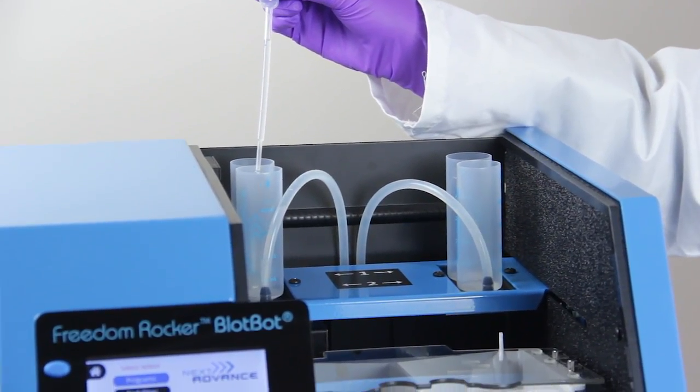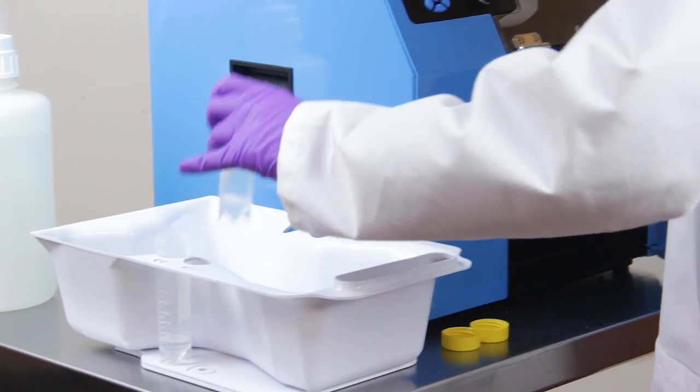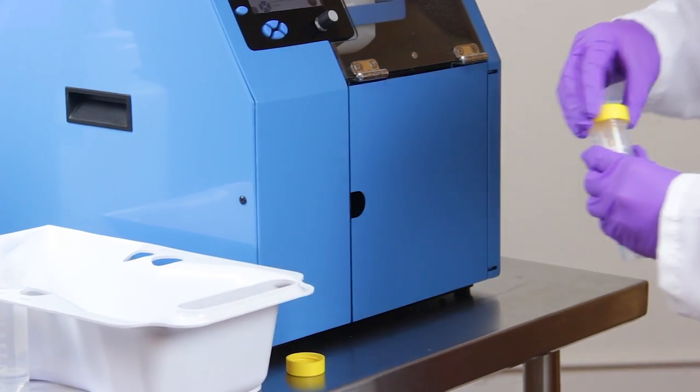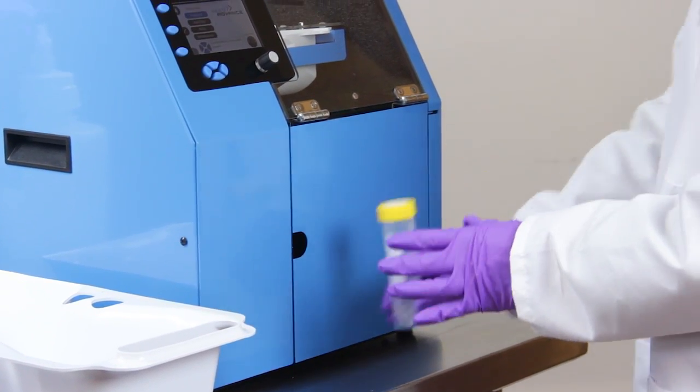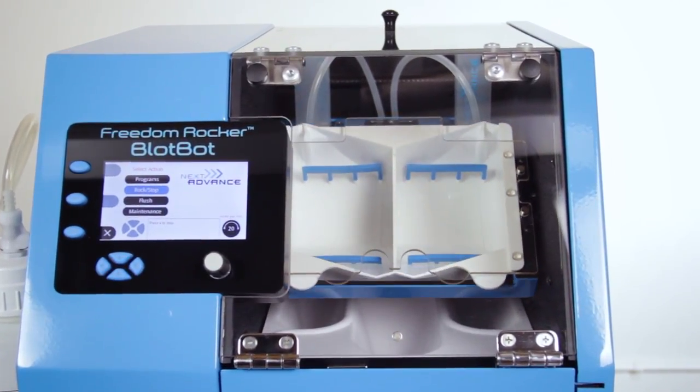It also uses very little antibody — only 3.5 milliliters for a standard mini-blot — and you can recover almost all of the antibody for reuse. There are no expensive single-use cartridges or proprietary reagents to buy.